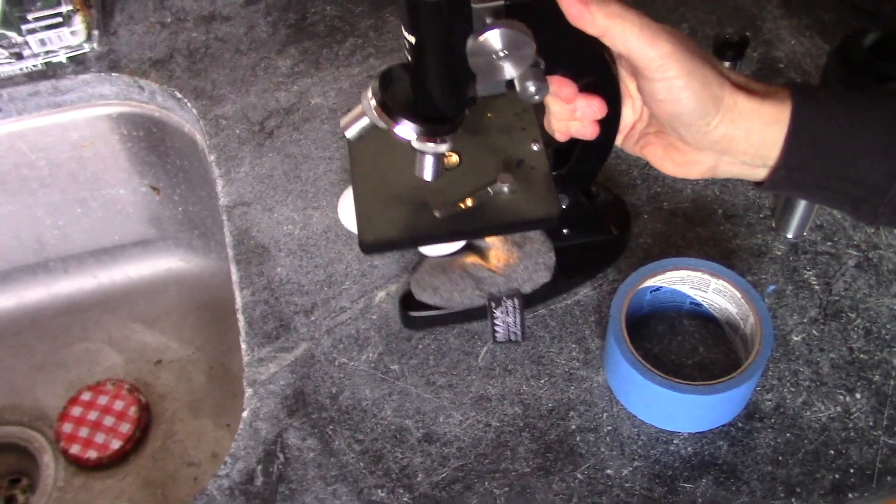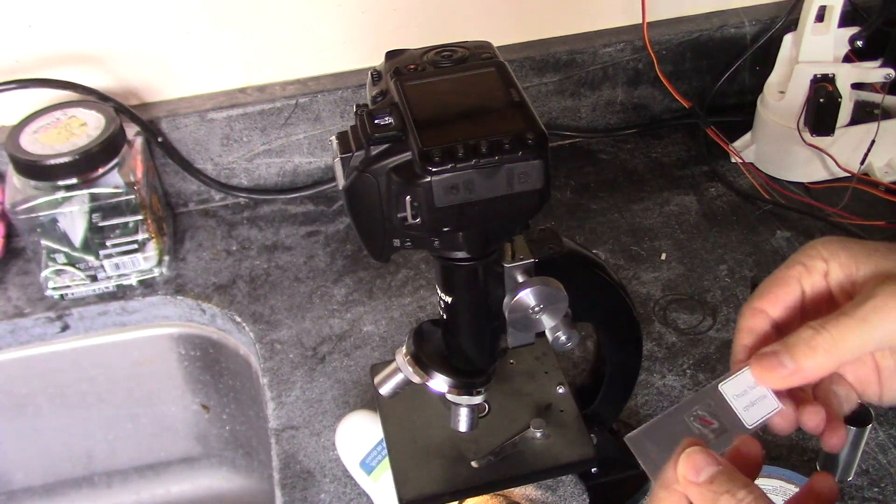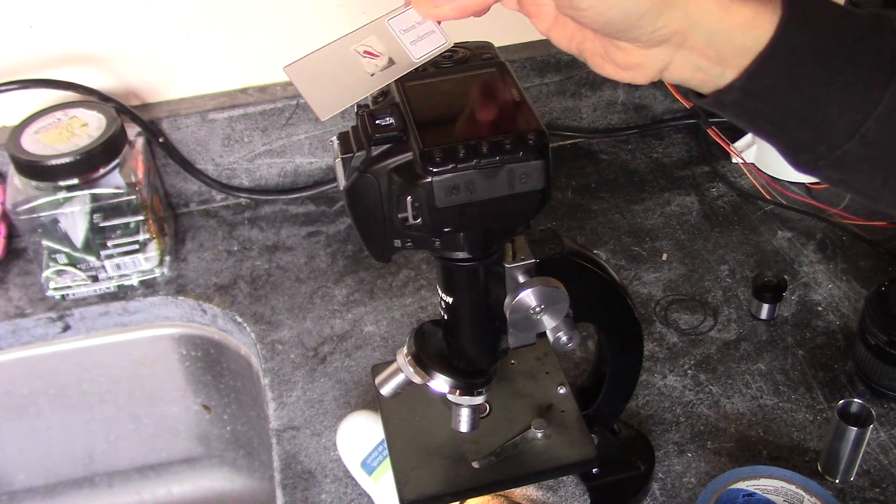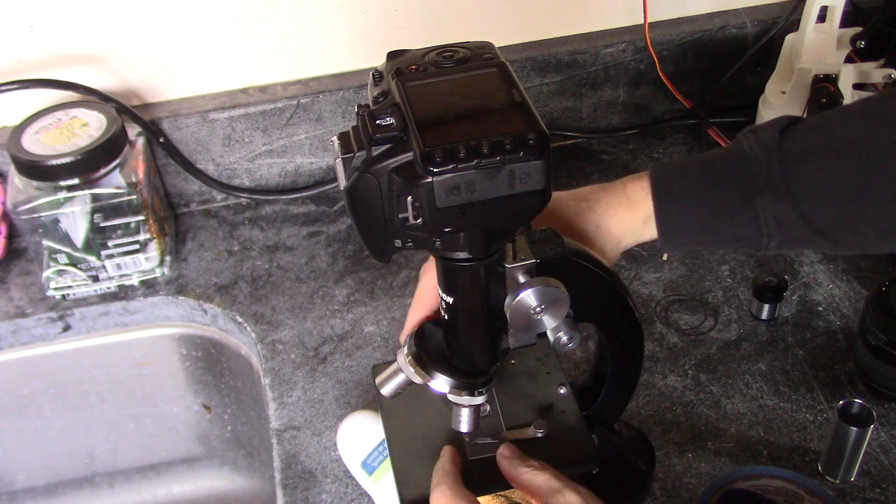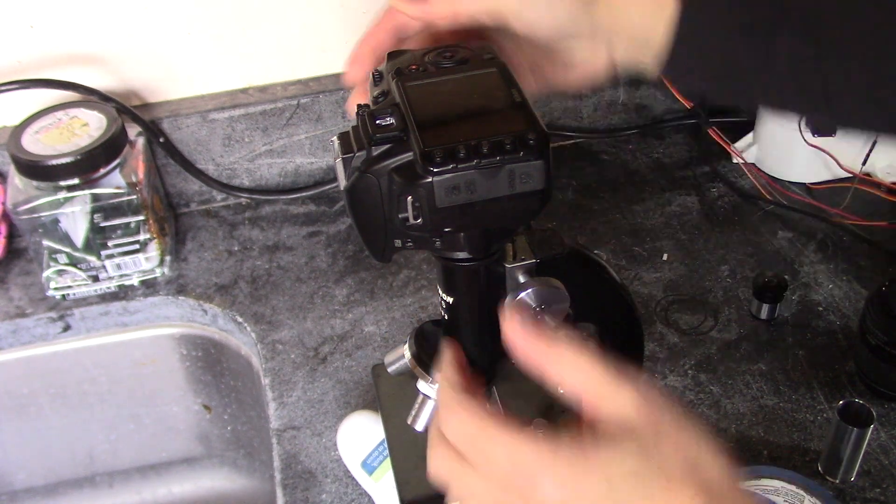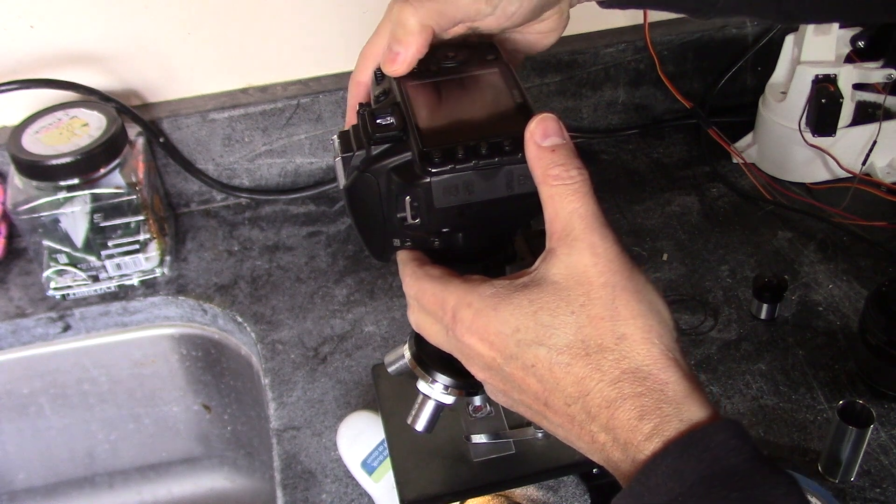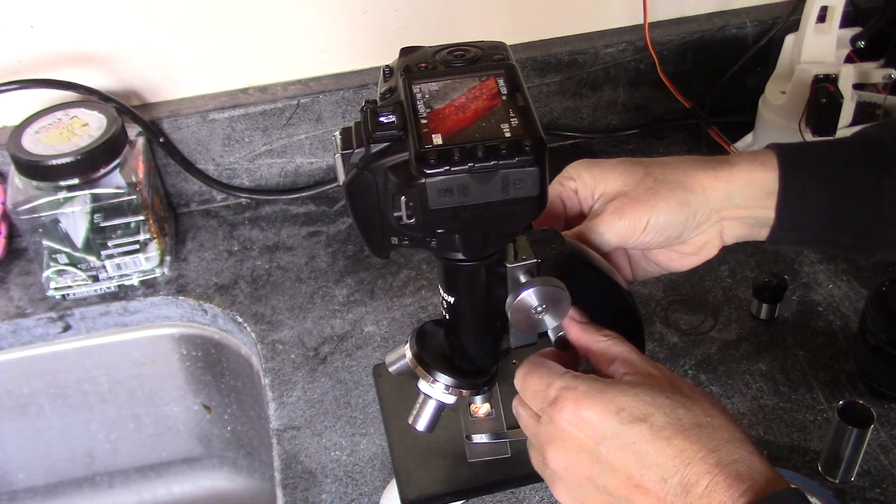So let's give it a shot here. So here is an onion bulb epidermis, and let's take a look at the low magnification. Turn the live view on, there it is, okay, all right.